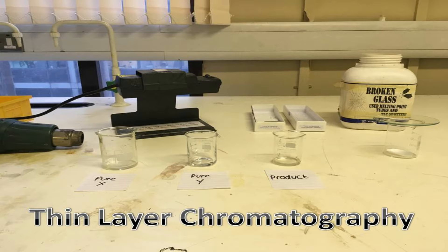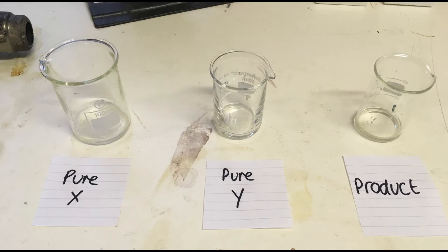It is commonly used to determine the purity of a product or for assessing the progress of a reaction. Today we are going to be assessing the purity of a product and seeing whether any starting material remains. In the reaction I wanted to convert compound X to compound Y, so I have produced a sample of my final product P.